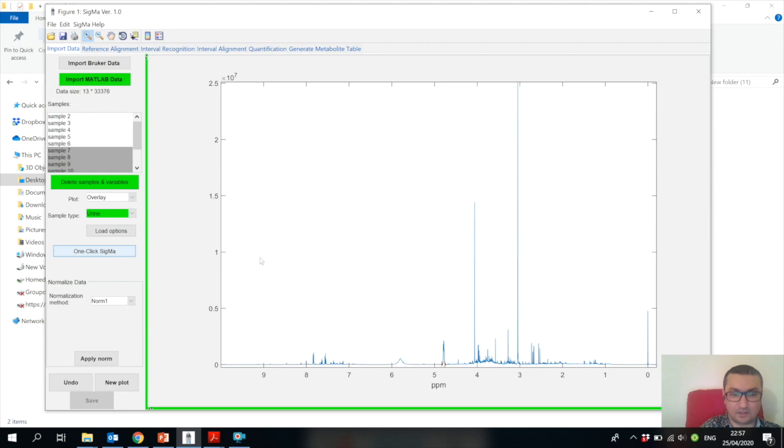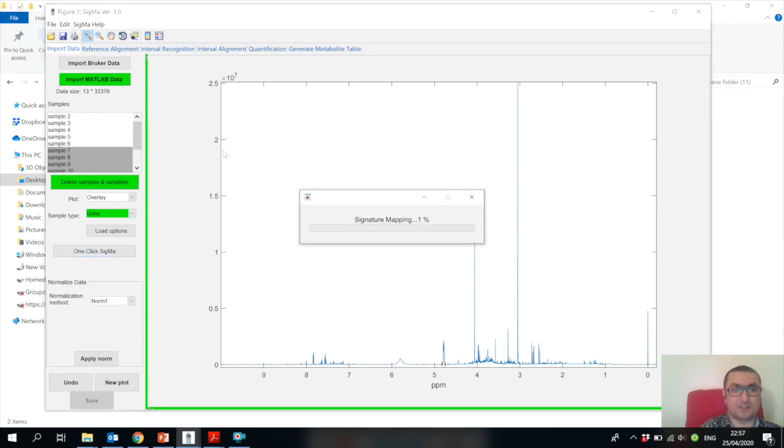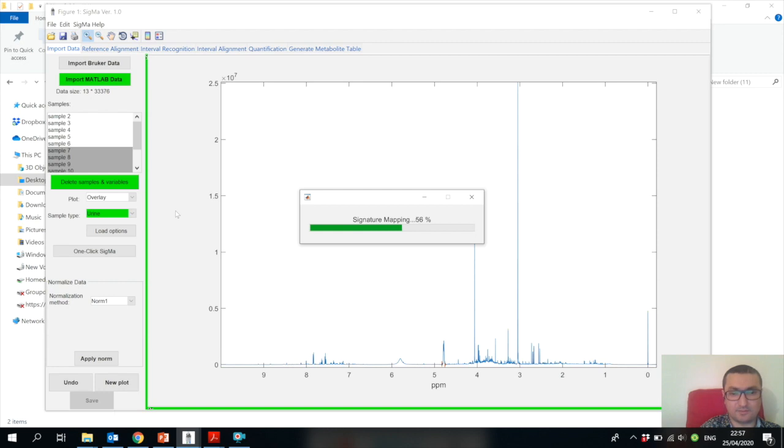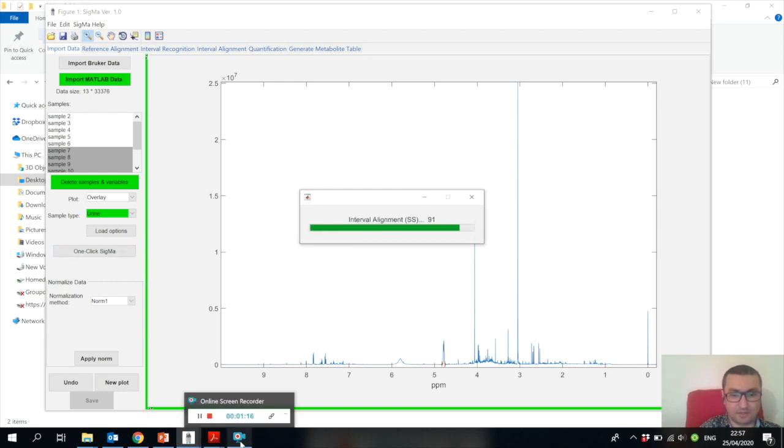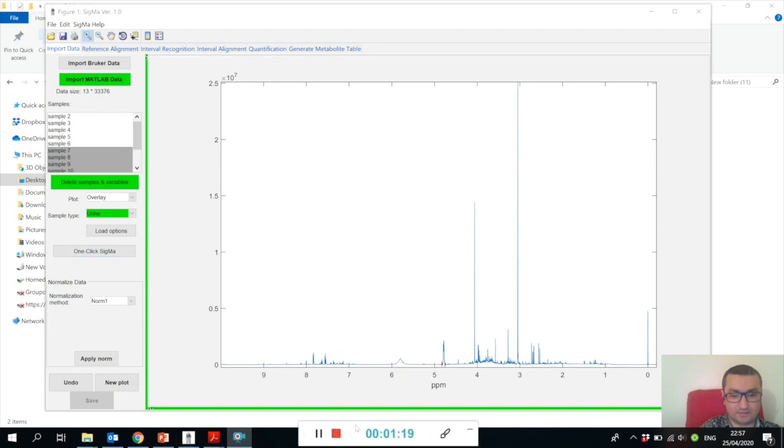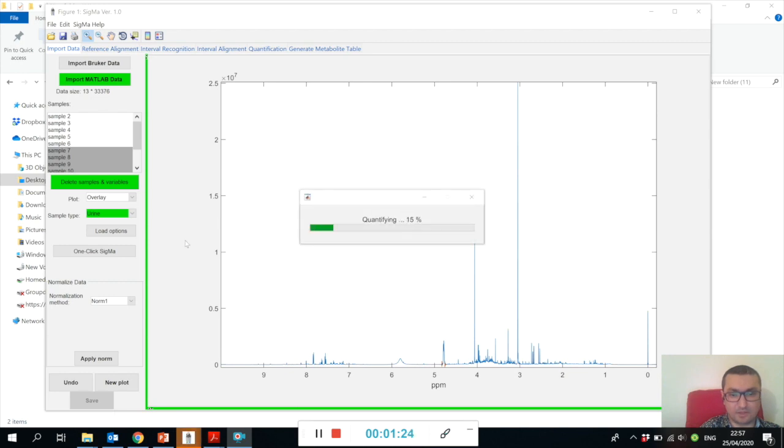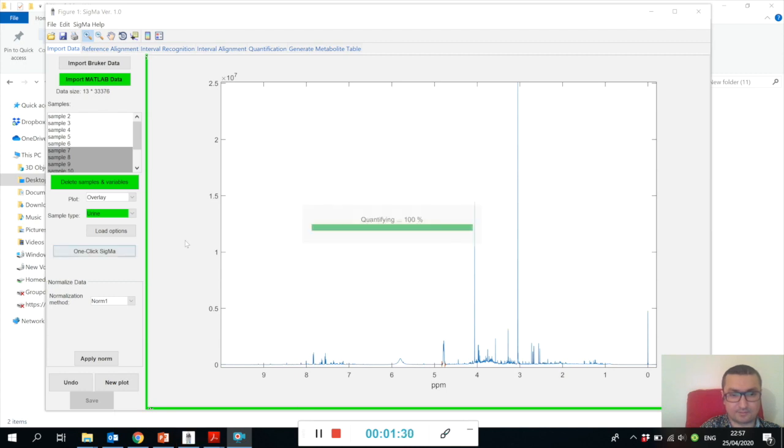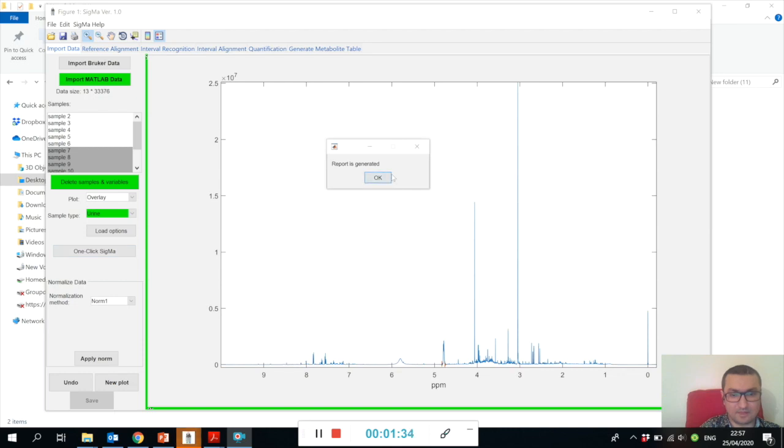Let me try to do it with the current settings of the Sigma urine parameters. We should be able to generate the metabolite table directly. We just need to wait a little bit. Now we have mapped and we are quantifying all the signature signals.